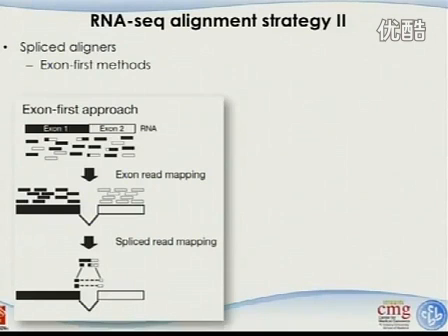And when you detect so many different reads, some black goes to exon 1, and white goes to exon 2, and there are some mixtures, and these are junction reads. So the general approach is you first just map your reads against the genome. Don't worry about the RNA, okay? So you find some of the reads mapped here, others mapped here, which is perfect, and none of those hybrid reads will be mapped because they are across junctions.